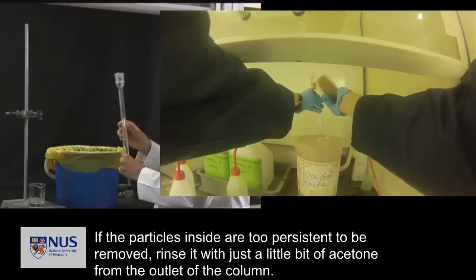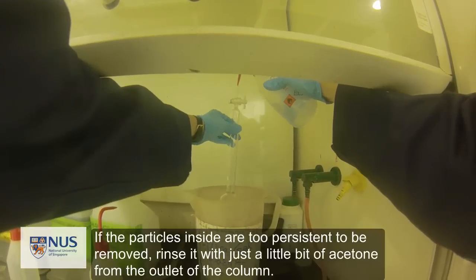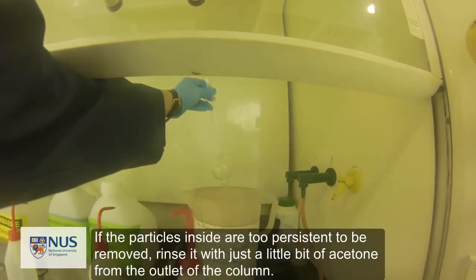Invert the column and use the rubber tubing to tap on the walls and to eject the silica gels. If the particles inside are too persistent and stubborn to be removed, rinse it with just a little bit of acetone from the outlet of the column.